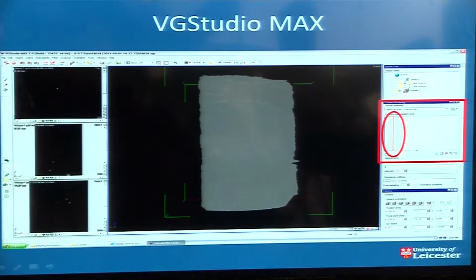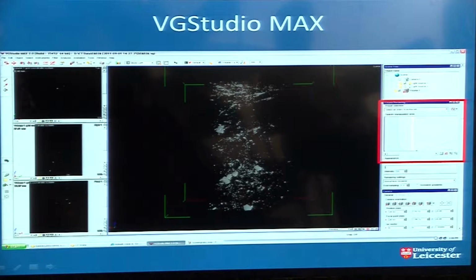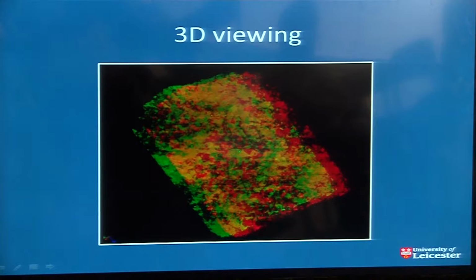This little histogram on the side is basically, you can effectively think of this as relative density. So we've got lots of material at this relatively low density, which is most of the silicate material in there. We start to get rid of that, and we zoom in into that area. We can start to see a little peak there, and we can segment out that histogram into different phases, okay? And we can color them as we so wish. I tend to always color gold yellow. And I'll show you some more of these images later.